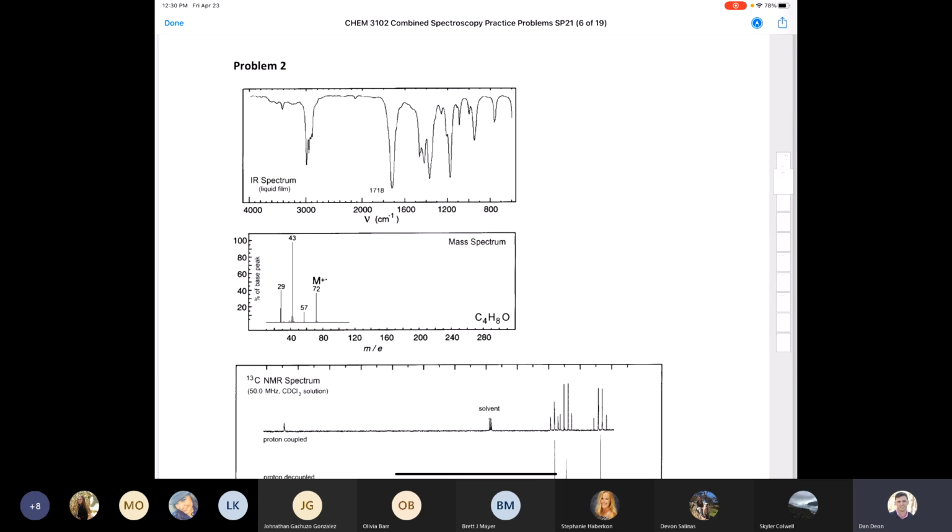But you know what? When I see a spectroscopy problem, I'm kind of like a kid in a candy store. I'm just like any other human. I can't help myself, right? What do I go for? The low-hanging fruit, right? If there's something that sticks out to you right away, there's no harm in just saying, okay, I'm going to zoom in on this right away.